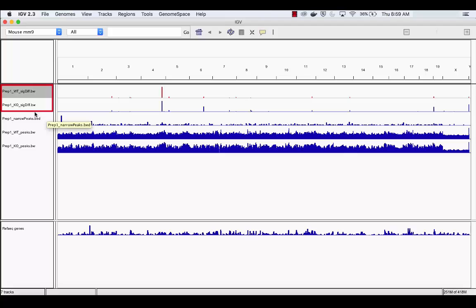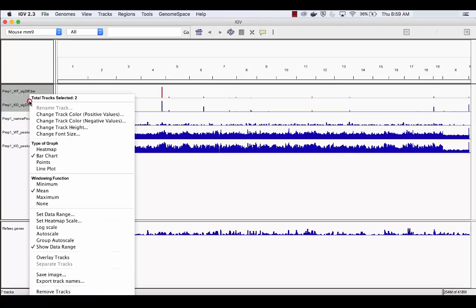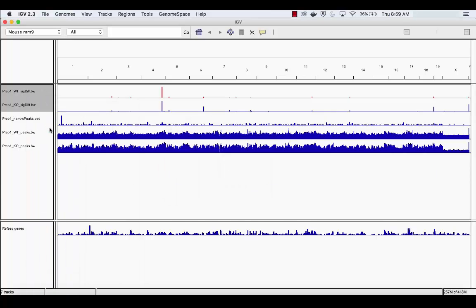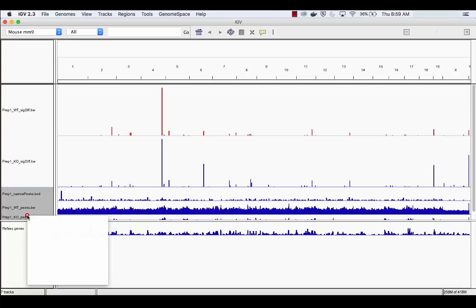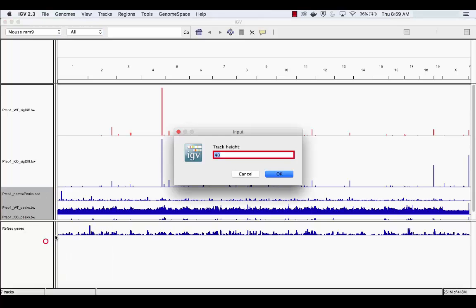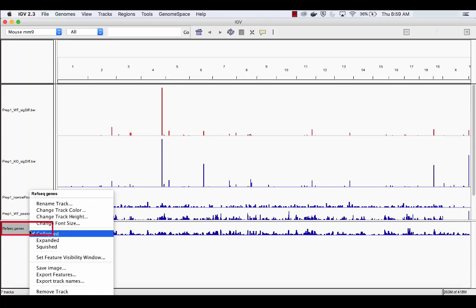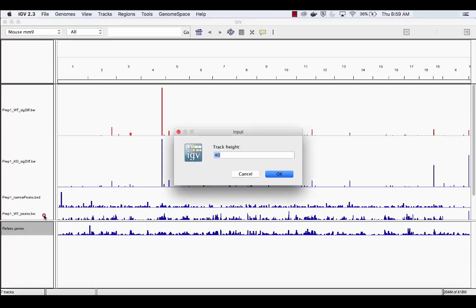Next, highlight both gene expression tracks and right-click. Change their track heights to 150. Then, highlight all three max output files and right-click. Change their tracks to 60. And finally, change the track of the mouse reference genome to 60.